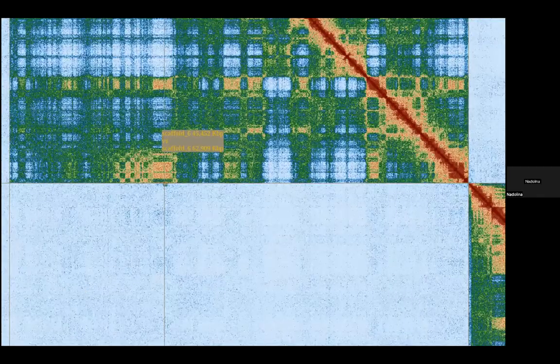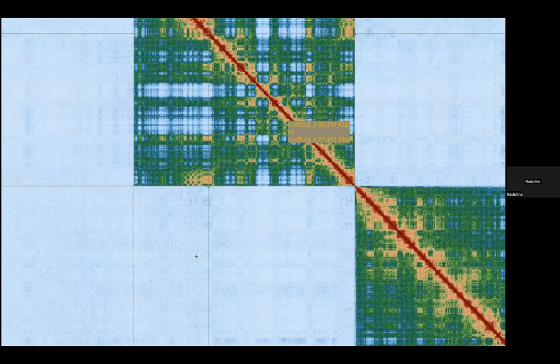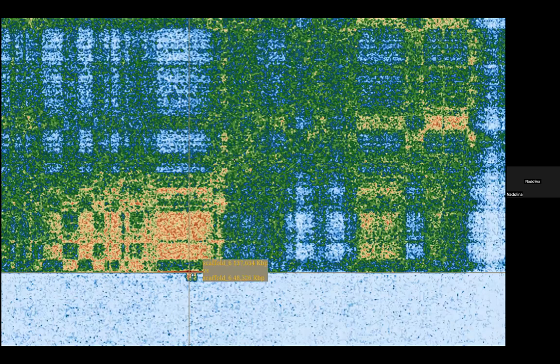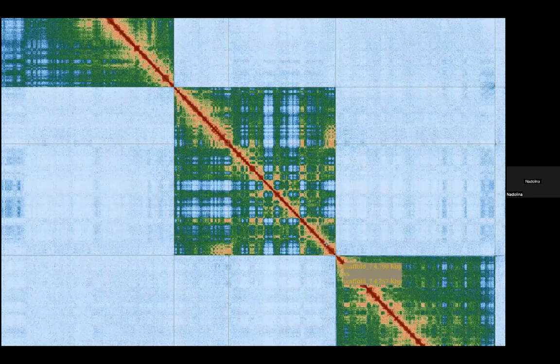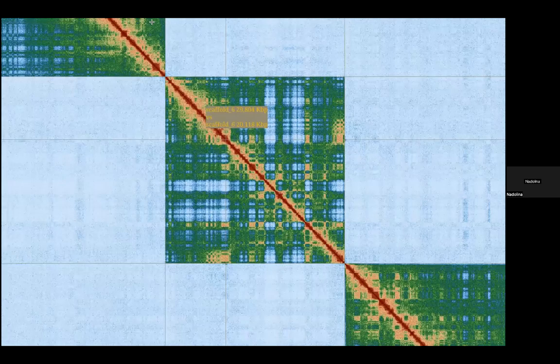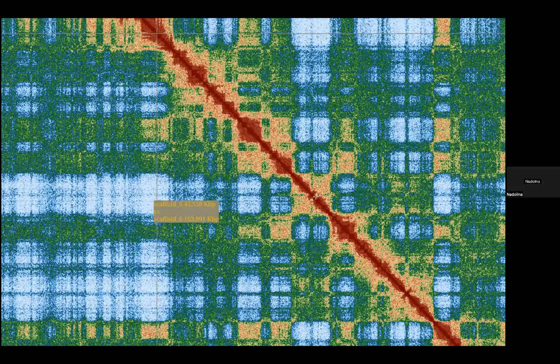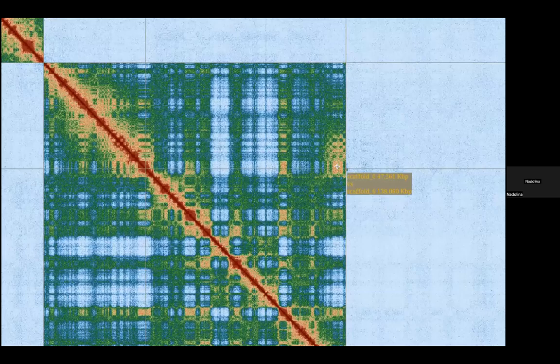There's a little bit of signal still there, which I might in another instance try to get maybe a little bit closer, a flip, but it also could be that this piece is interacting with the telomeres over here, and that might have been why it was misoriented in the first place. So I wouldn't worry too much about that little bit of red signal we're seeing down there. Okay, so now we flipped it and we resolved that off diagonal signal, and it's looking a lot better.